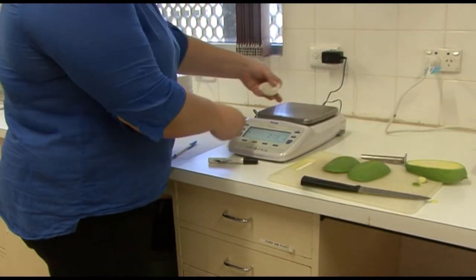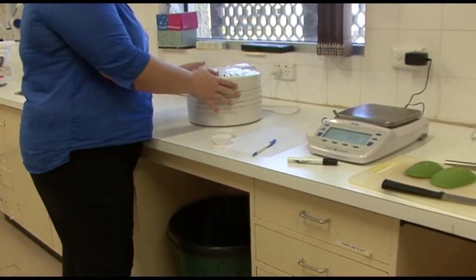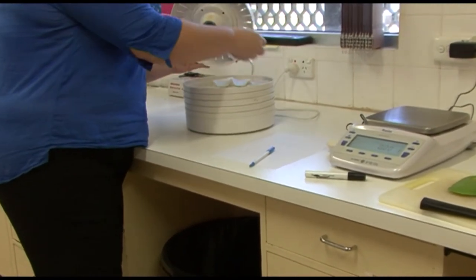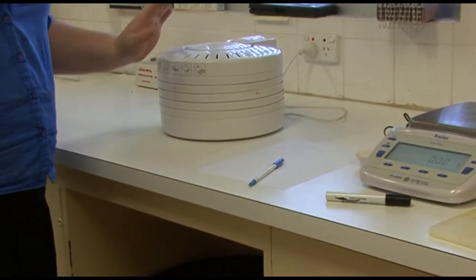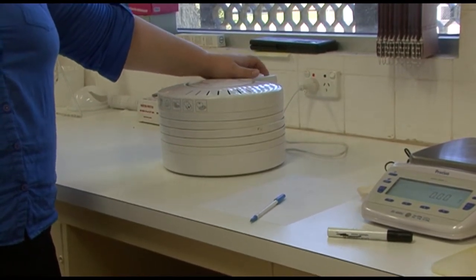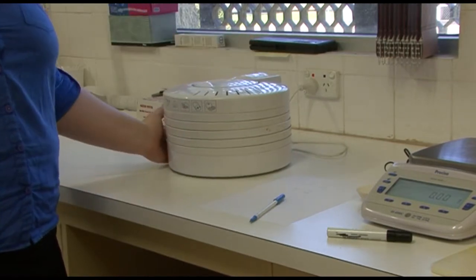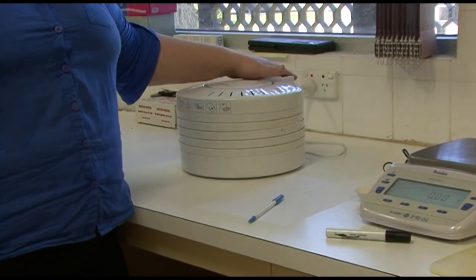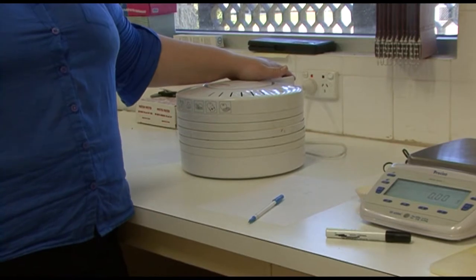Now after the wet weight has been recorded, you then put it into either your desiccator or your microwave and turn it on. When you put the plugs into a desiccator, you leave them in there for 48 hours to dry. You can take two readings at 48 hours, and if there's no change, then all of the moisture has gone from the plug and that will be your dry weight.